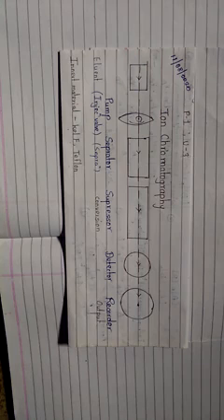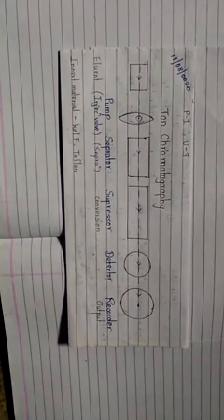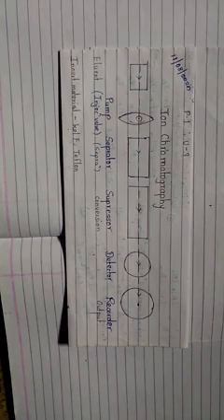Next suppressor, where by using the eluent separation takes place and gives the better signal of anion or cation. Next is detector, where detection of ion takes place. Next one is recorder, which records this signal.